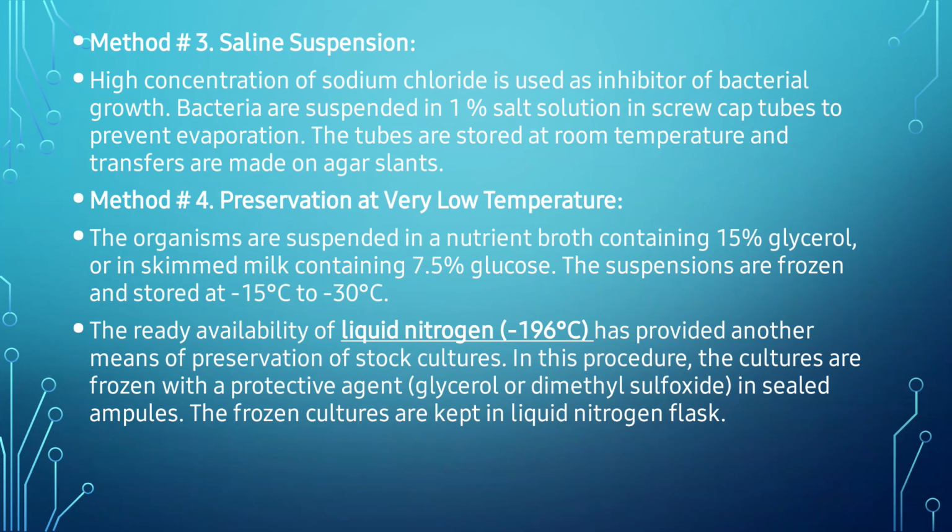Next method is saline suspension. A high concentration of sodium chloride is used as an inhibitor of bacterial growth. Bacteria are suspended in 1% salt solution in screw cap tubes to prevent evaporation. The tubes are stored at room temperature and transfers are made on agar slants.